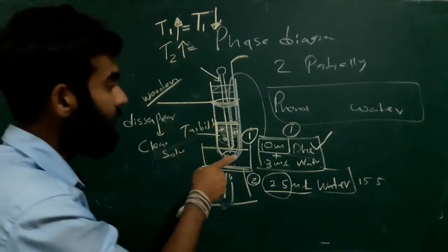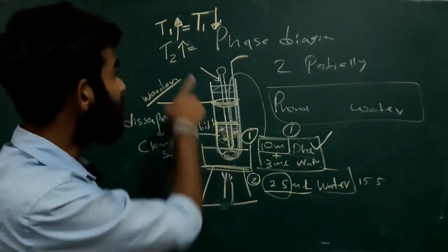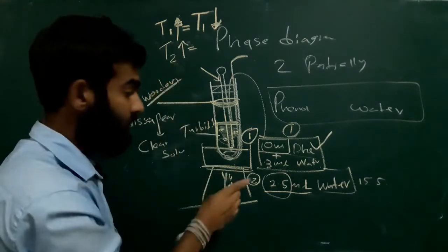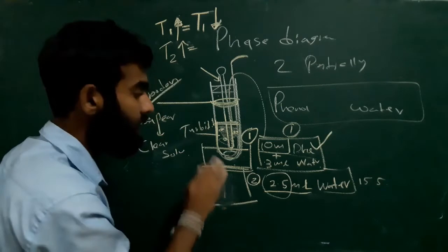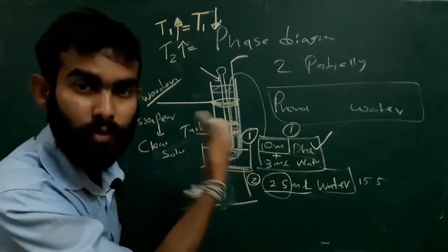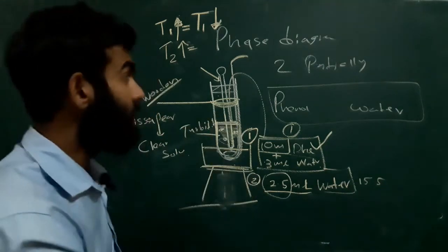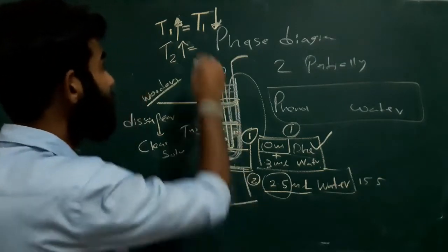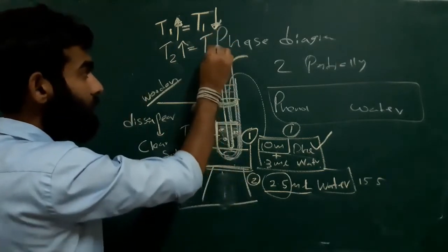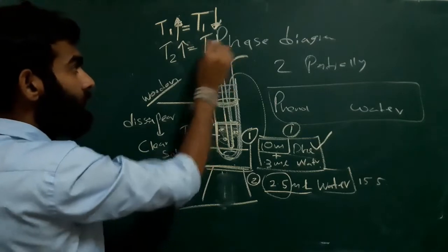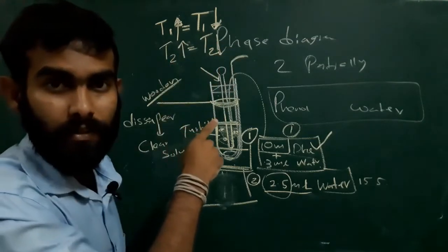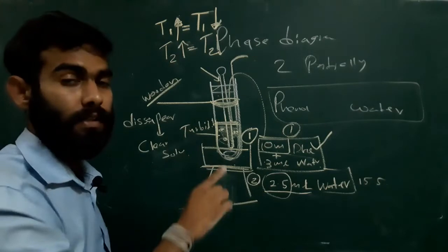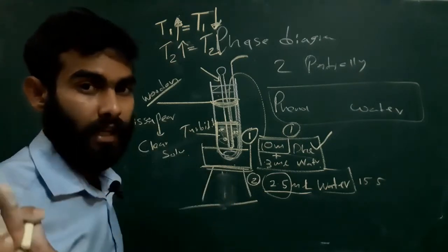When heating, we observe this temperature. After seeing the clear solution, we remove the Bunsen flame and allow the solution to cool. When cooling, we can see a reappearance of turbidity. We read that temperature. The reappearance temperature should equal the disappearance temperature. If not, you made a mistake.